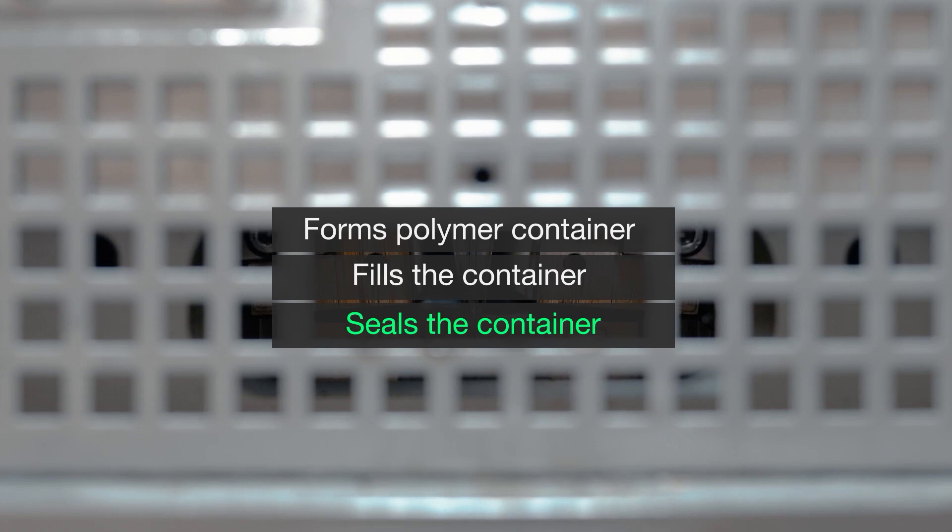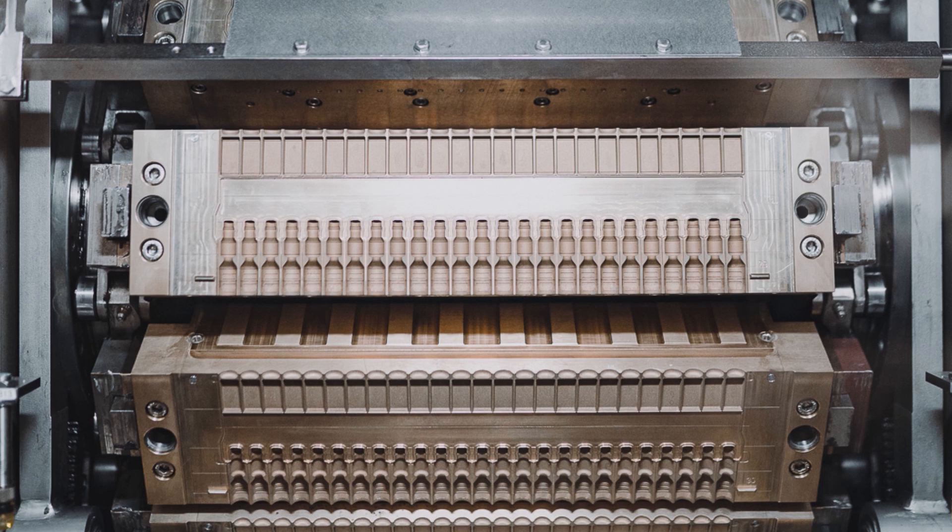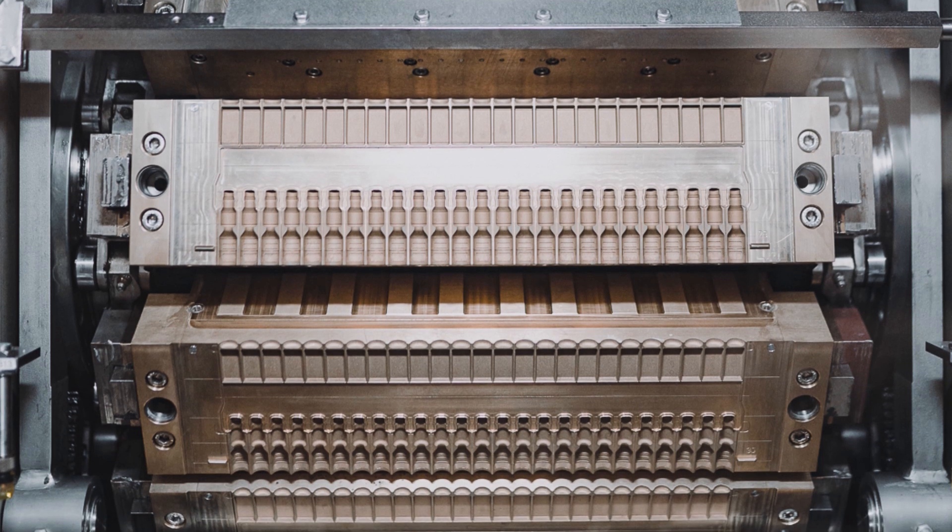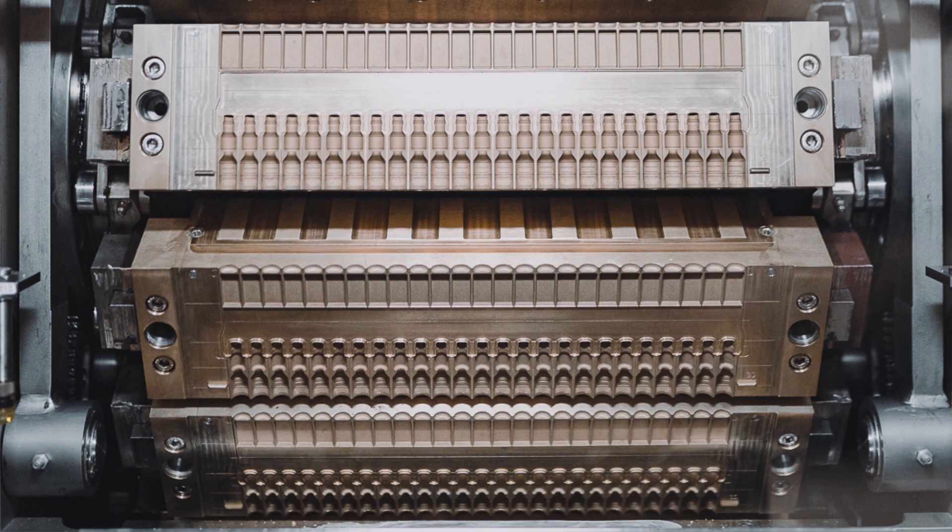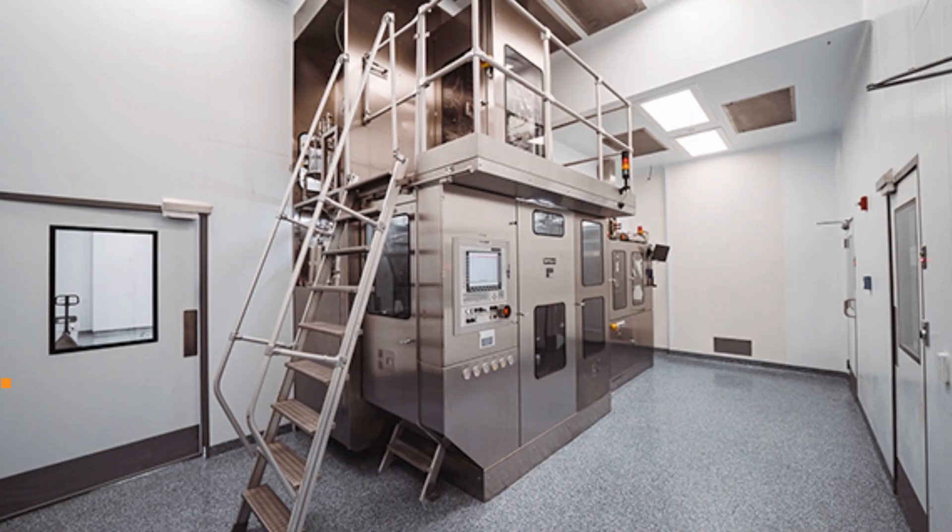by hermetically sealing of the container's opening, and this all happens within a matter of seconds. Details of the BFS process vary slightly by machine model and manufacturer, but all BFS models perform the same general functions.